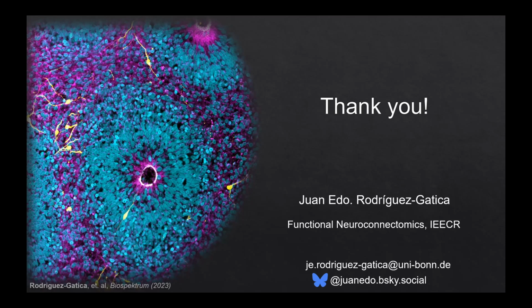But I want to clarify that we only use CHAPS for the permeabilization, because CHAPS is not good with some antibodies. I fully understand that, of course. For the permeabilization step, would you still be able to expose occluded epitopes that are buried deep within compartments, or you didn't look into that? Yeah, I haven't looked into those ones. So yeah, not a good question. I haven't tried that, but I just wanted to be clear that we used it just for the permeabilization, and for antibody staining, we use Triton in the blocking buffer, right? Thank you.